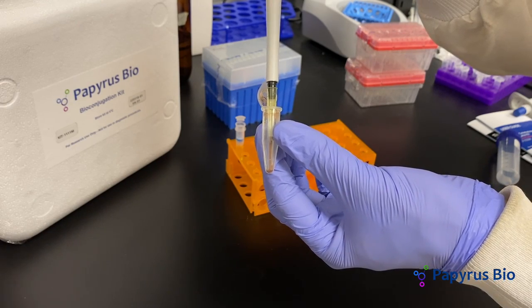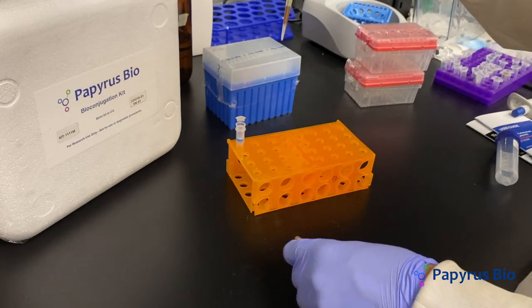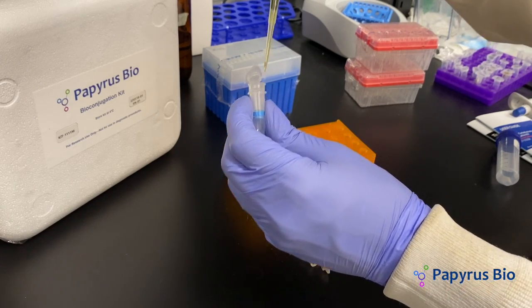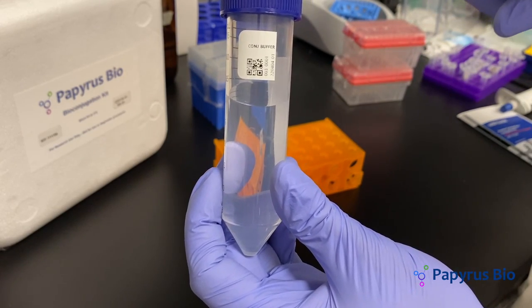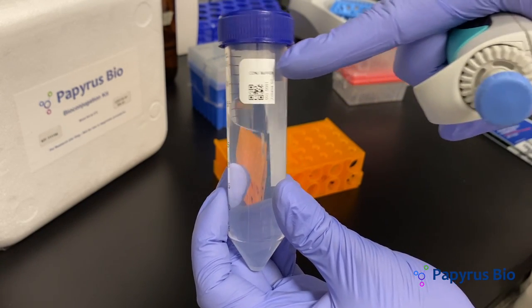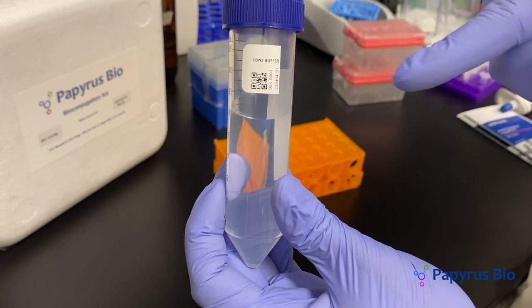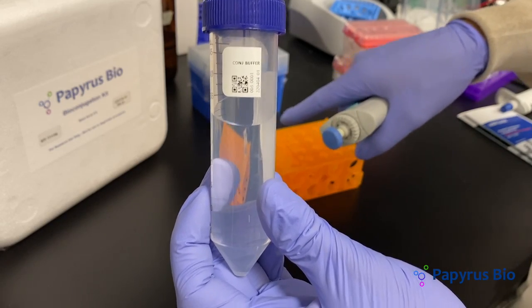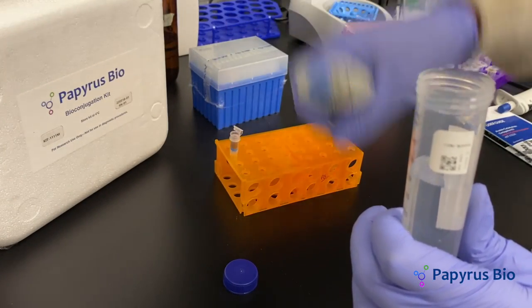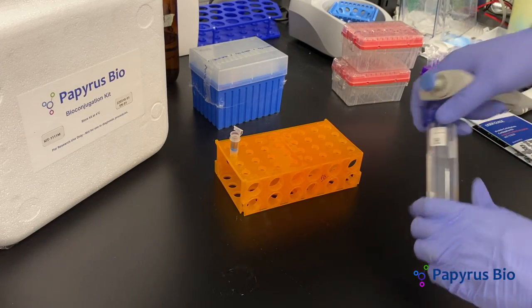Add the protein solution onto the top compartment of the filter tube. Buffer exchange involves replacing the buffer a protein is in — we will replace the brown buffer with the conjugation buffer. QS up to 500 microliters with conjugation buffer.